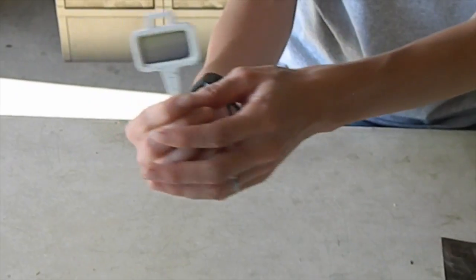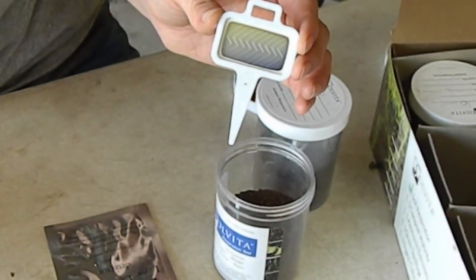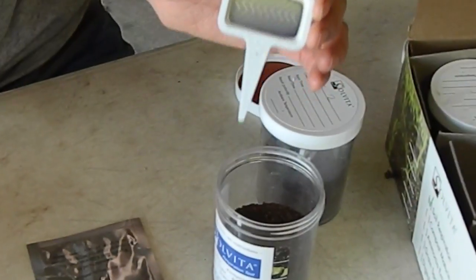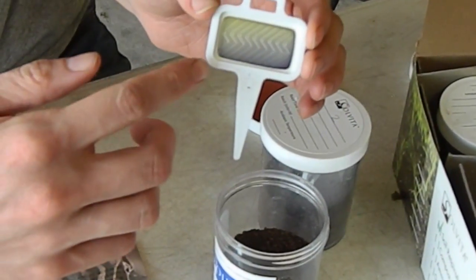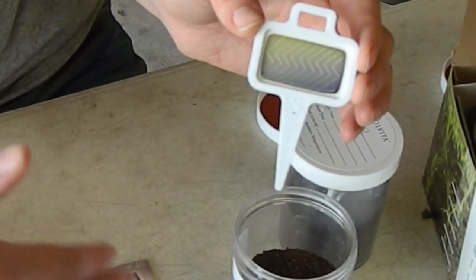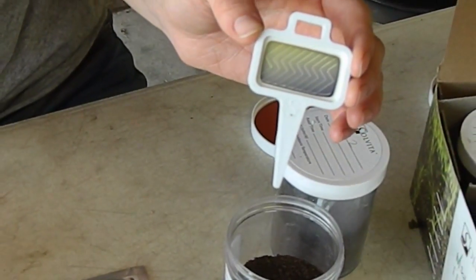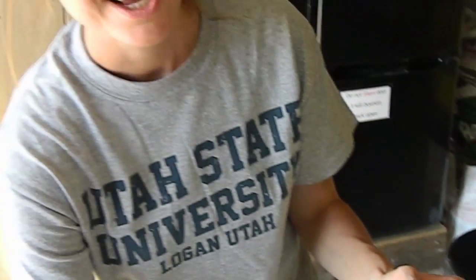Some other examples: on this paddle you can see there's some yellow happening, but there's also a lot of blue going on. These are kind of old, so they aren't really accurate at this point, but I just wanted to show you an example of what they look like. The bluer they are, the lower the respiration — and the lower the respiration, the fewer organisms that are active in turning over nutrients in your soil.